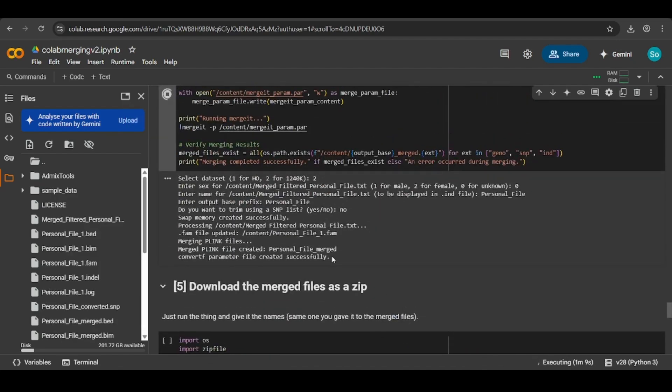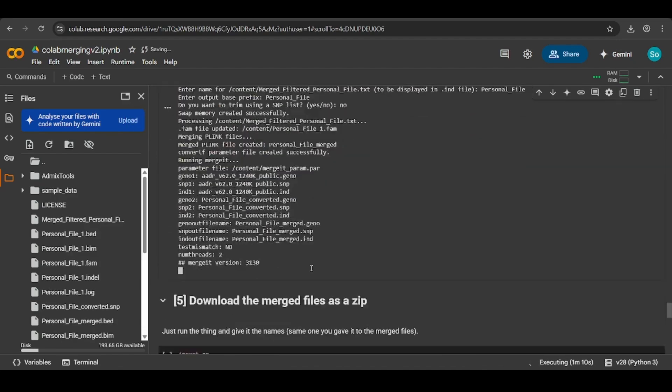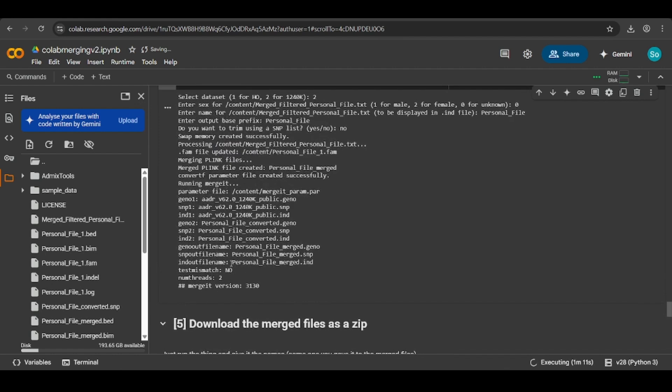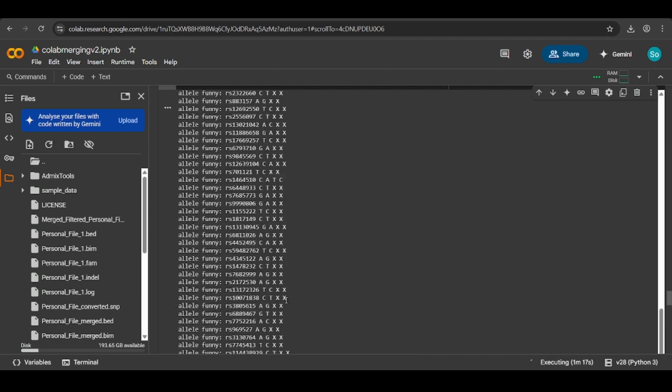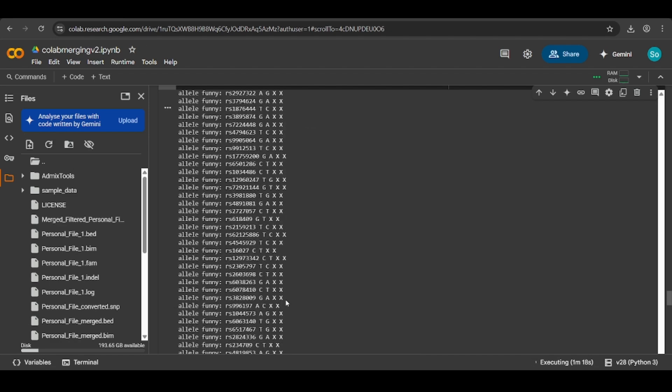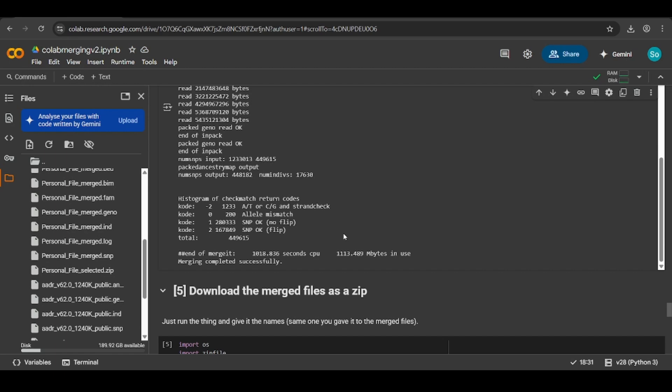Then it will take roughly 20 minutes to merge. Once it's done, I'll come back and we'll finish the rest of the tutorial. Right, so the merge took around 20 minutes. It's finished, as you can see. Merging complete successfully.